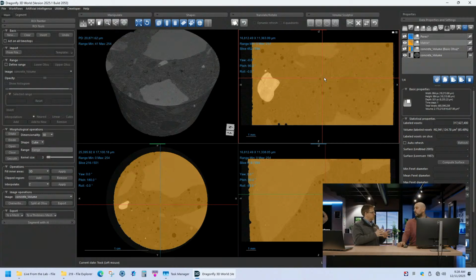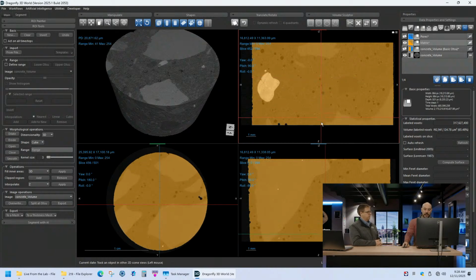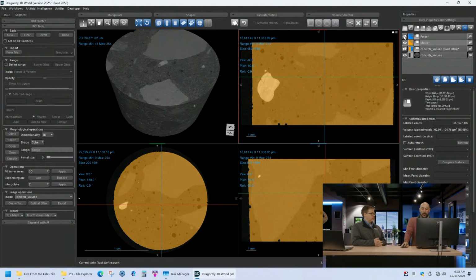Now the matrix is all voxels in the whole sample. What's different is that before, it didn't have the voxels of the pores. This is the pores and the matrix now, so this is our total volume of interest, the whole volume. I would like to point out it did not completely close everything, because these are at the end. There are other operations that close that up, but we're not going to close it up right now. This is simple, back of the envelope. So one could almost say this is the closed porosity. Exactly.